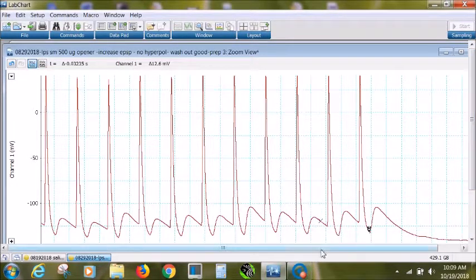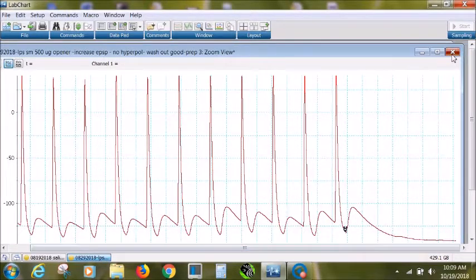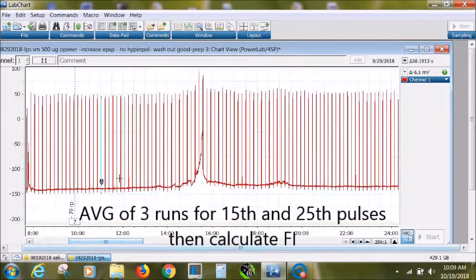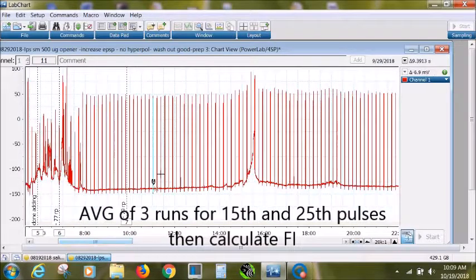So we can go ahead and X out of this. So yeah, just select the next 2 sets of 25 and record the data for those as well. And then we are going to move our marker back to done adding.